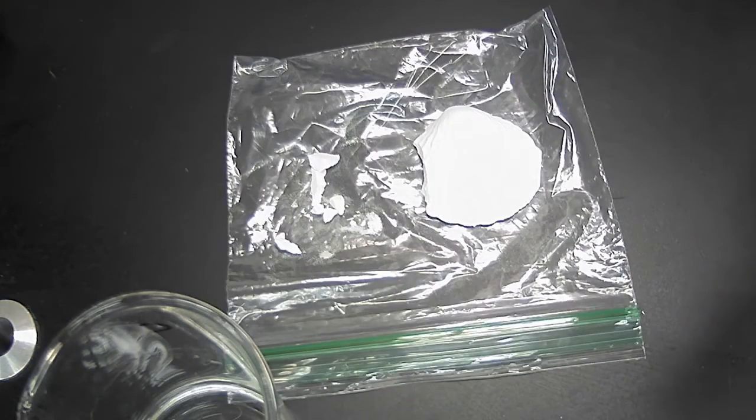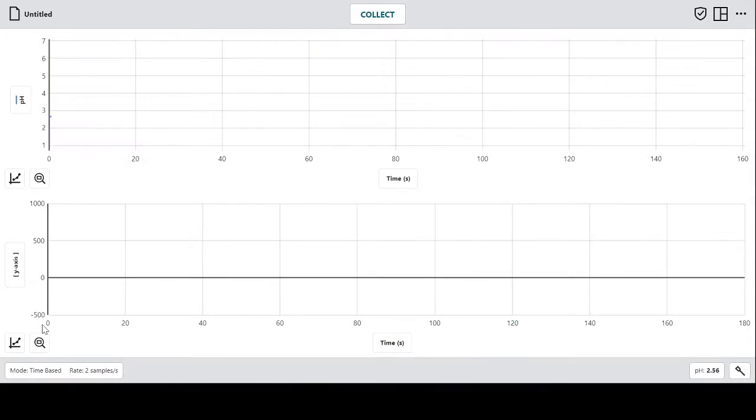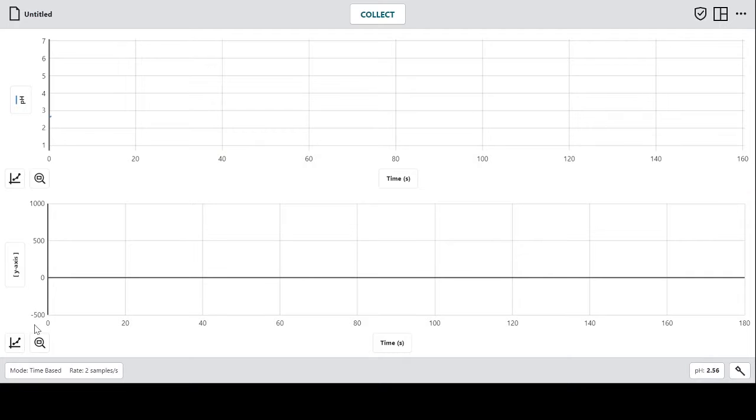And also, guys, we're going to cycle back and forth between a little graphing application. So what we have is a probe here. This is a wireless probe. As you go on and pursue your science careers, these are things that you're going to get used to, things that are becoming more common. We're using this wireless probe, and that is going to produce data on this graph, which you're going to need to reference for your lab report.